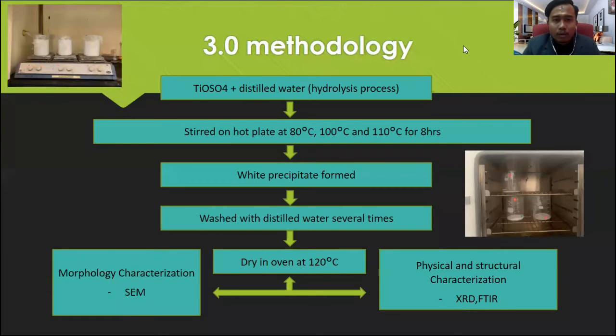Okay, for the third topic, which is methodology, after gathering all the equipment needed, the titanium sulphate, TiOSO4, will be added with distilled water for the hydrolysis process.